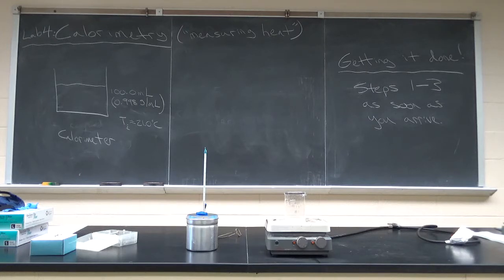That was almost 40 minutes. This one won't be nearly as long. Again, trying to be a little more efficient, getting down to what you just need to know before you come to lab, and then post-lab calculations. So in terms of what you need to be able to do when you come into lab, be ready for steps 1 through 3 as soon as you come in.